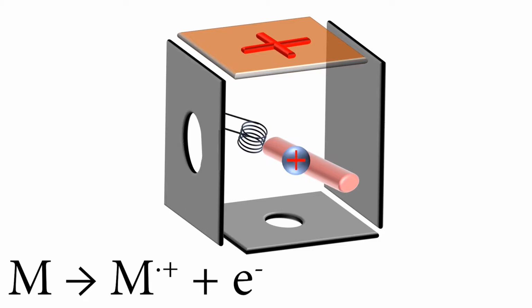Electron beams are a pretty simple way to put energy into molecules, and you tend to, at least initially, get an ionization event where the molecule absorbs the energy of the electron beam. That results in excitation, which ejects an electron from the molecule, and then you end up with this radical cation, M dot plus, that has the same mass as the molecule. We call that the molecular ion.